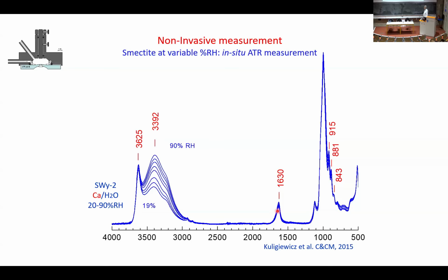Yes, it is. It has a stronger extinction coefficient, so any change there will be manifested quite a lot. Also, I don't want to say more. Wait a couple more transparencies. Okay, so that was a comparison between the saponite and the talc.